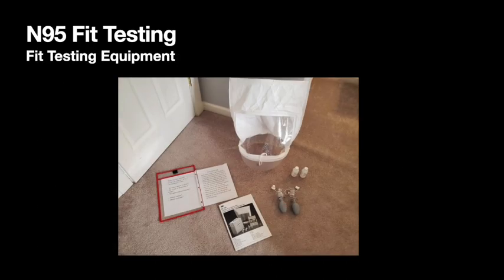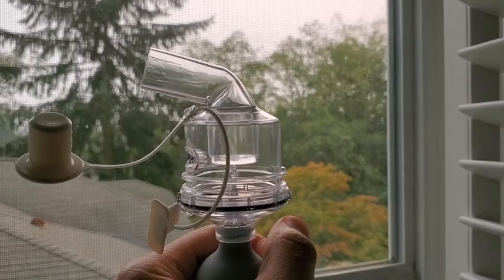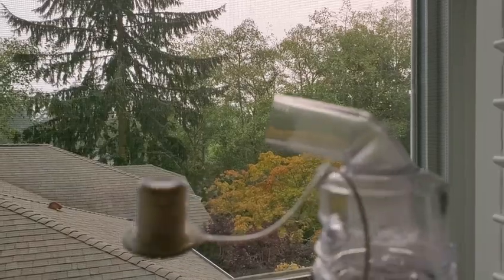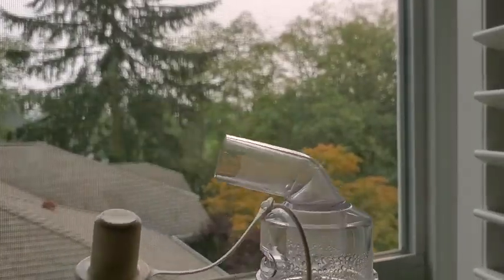And here's a quick picture of what your fit test equipment should look like. Your hoods, your nebulizers, your solution, your instruction sheet. Take the nebulizers and pour about a teaspoonful of solution into each of them. So one for sensitivity and one for fit solution. And make sure, if they're not already, that they're labeled which is which. You'll know you have the nebulizer set up properly if you squeeze them and you notice a small mist coming out of them.